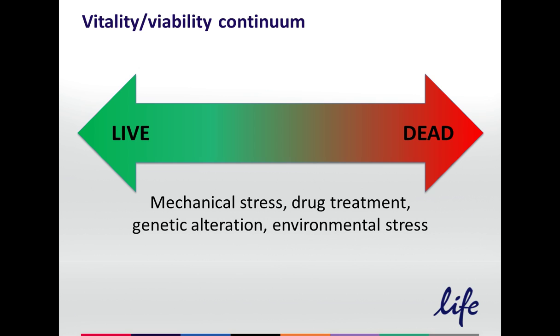And while sometimes that change towards more of a dead phenotype is beneficial, especially in the scenario of cancer, we do normally look at trying to keep the cells alive. So I'll normally refer to death as a bad thing for a cell, but please keep in mind that it might not necessarily be bad in your particular setup. We'll look at cell health, but really at the highest level today, we're looking at whether or not a cell is live or dead.